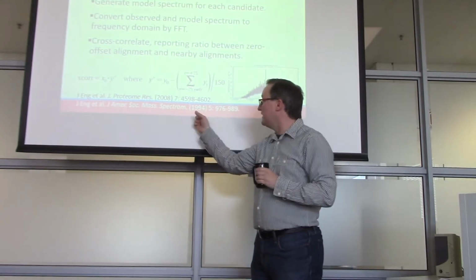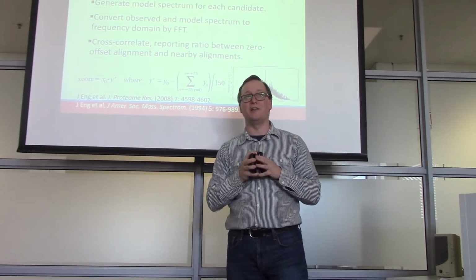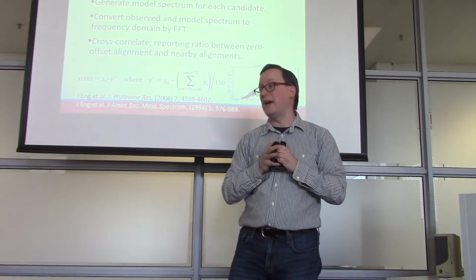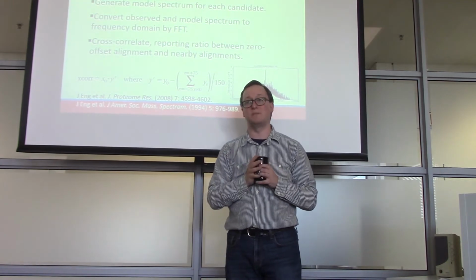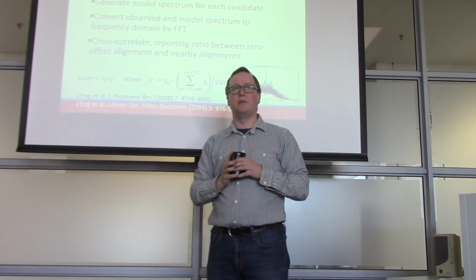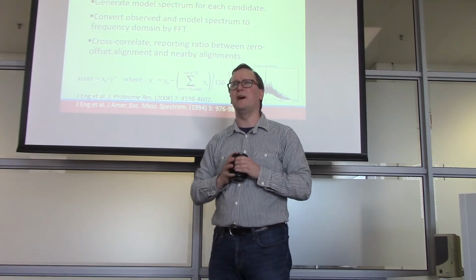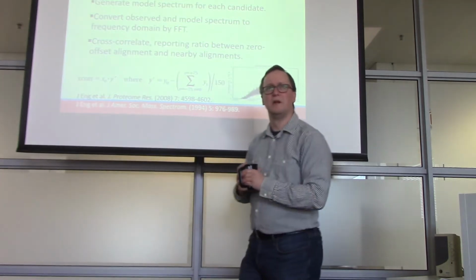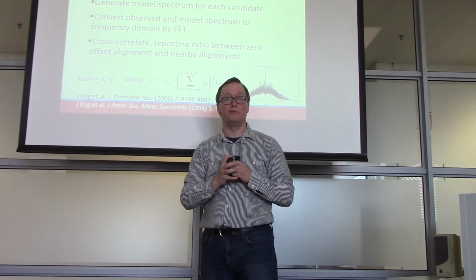So back in 1994, a guy named Jimmy Eng, who was a mechanical engineer hired by John Yates, created some software that would automatically determine the identity of a peptide associated with a tandem mass spectrum. That software was called Sequest. A lot of people confused it for a popular show from way back in time called Seaquest, which was set at sea and involved looking at marine animals. But that's okay. Sequest quickly became a very standard tool for our field.